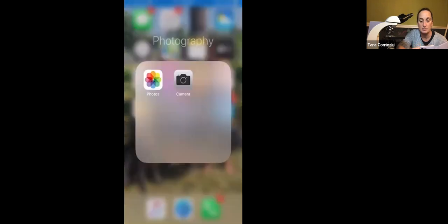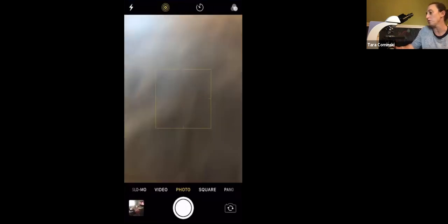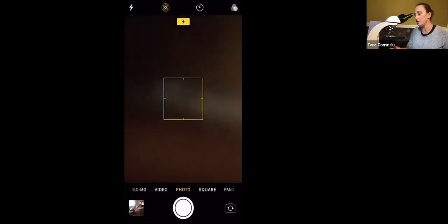And so what I did was I put in that colored thread slide. I'm going to move it to get it into the middle. I'm just going to get it under low power or scanning first, in focus. All right, so now let's look. I'll show you under here. You guys can see those threads. It's going to be hard, so I'm probably just going to show you this once because you're not going to be able to see the subtle difference, but you guys can see that there.